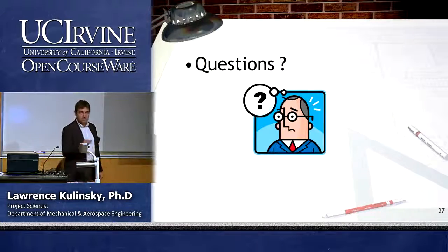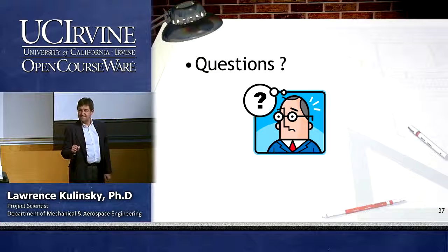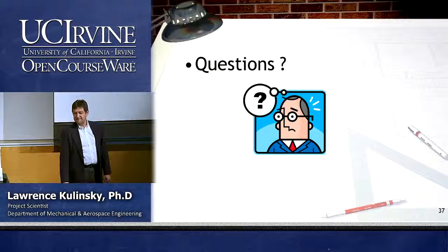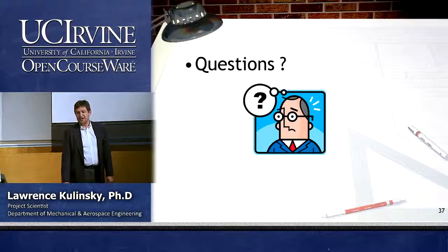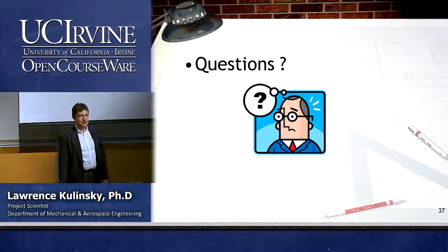So do you have questions up to now? Yes? Student: For the previous slide, does it need a transparent sample? Yes, you need that, because the light needs to go through.